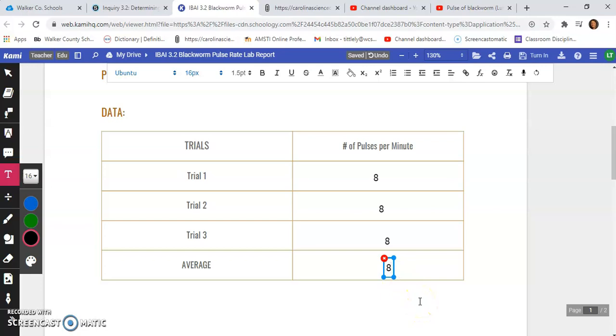So the blood moves pretty slow, but as you noticed, it moves in long pulses instead of those fast beats like us, because this blackworm does not have a heart to be pumping the blood. The blood moves because of those pulsations of its body, and its body movement helps to move the blood along.